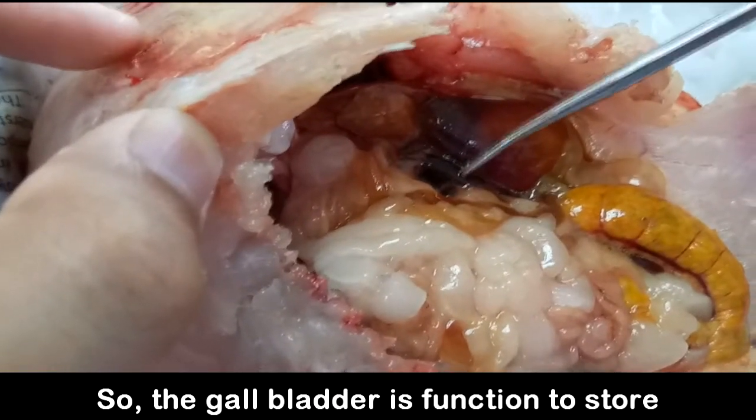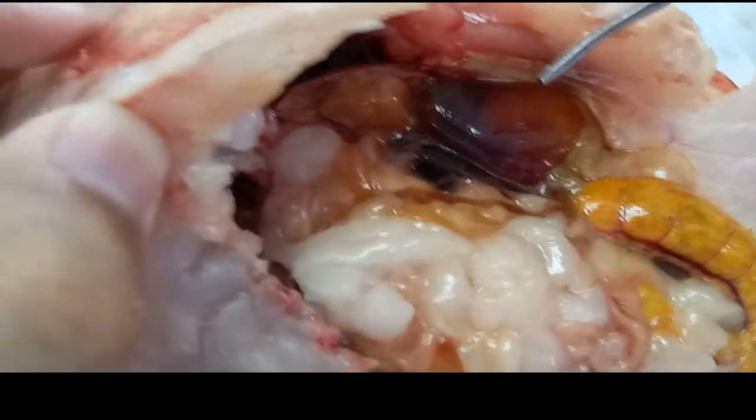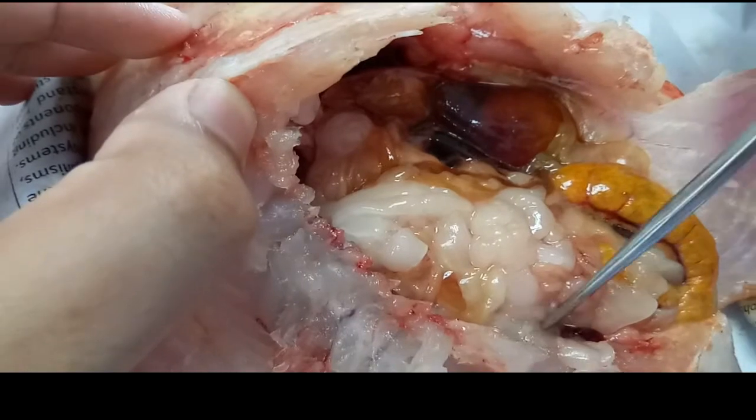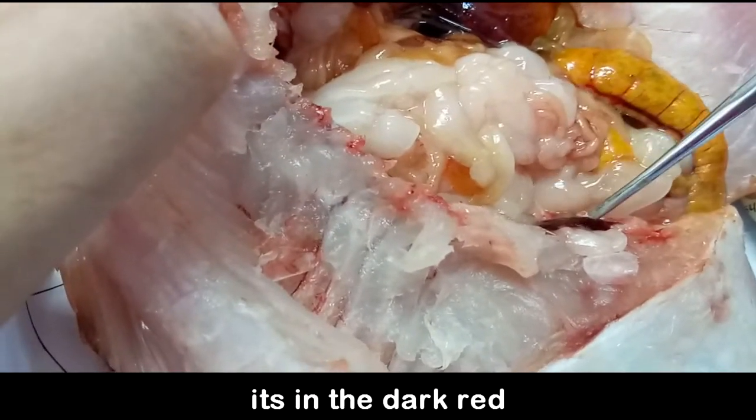So the gallbladder functions to store the bile that is produced from the liver. And then the spleen. The spleen is located in here. It is in the dark red.